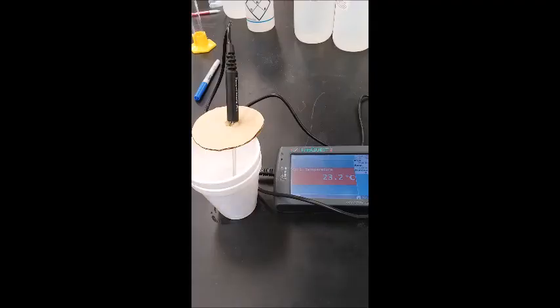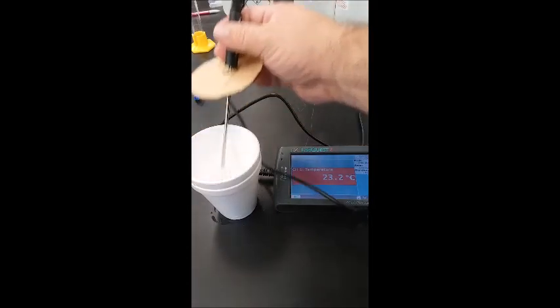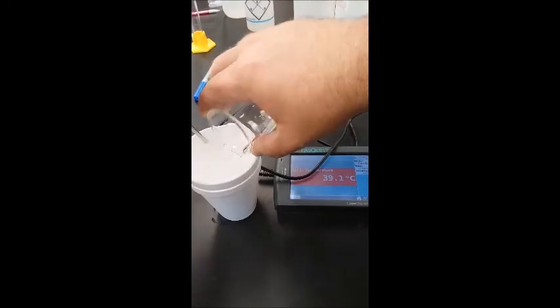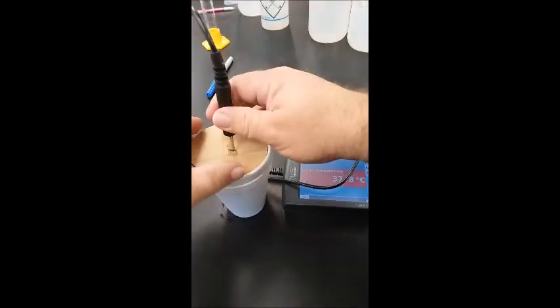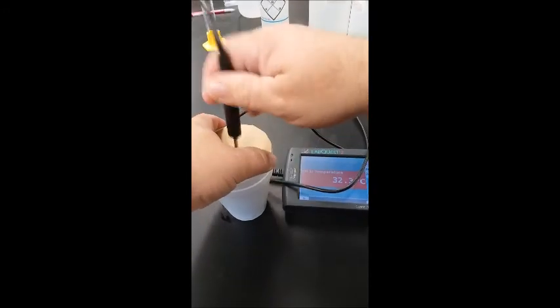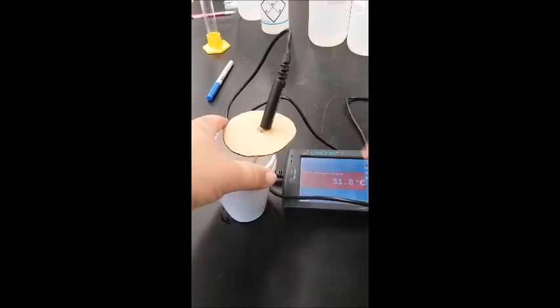We begin by recording the cold water temperature, which is 23.2 degrees Celsius. The hot water has been heating, and we add the thermometer to it. It will take a minute or so to get the final reading. We now see that the final temperature of the hot water is 39.8 degrees Celsius, and we can mix them and attempt to put the lid on. The temperature change is actually fairly rapid, and we will see that it will stabilize very quickly.